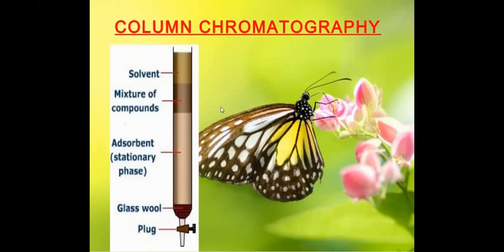The second thing is the mobile phase. Again, selection of the proper mobile phase is one of the very important aspects while designing the experimental procedure. So different types of solvent system, isocratic or gradient, a single solvent system or a mixed solvent system, a mixture of solvents, is used as a mobile phase. As you are observing in the slide, selection of the glass column.